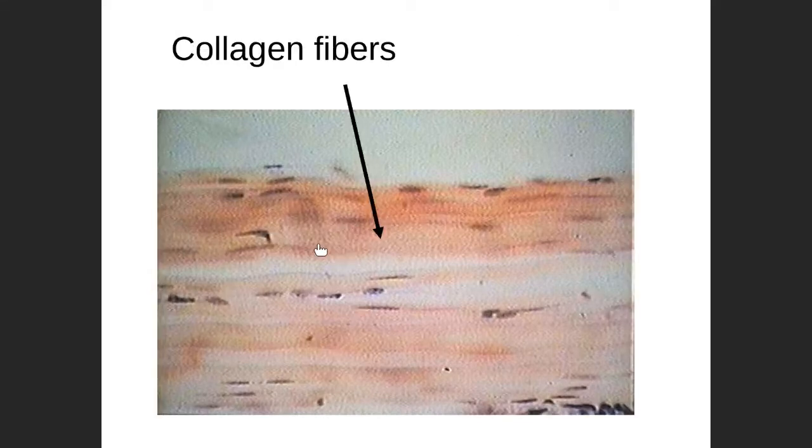Those are collagen fibers, and they're laid down one on top of the next, very similar to lasagna noodles if you bake or cook. They're tightly packed together. There's virtually no ground substance in between, and the majority of the tissue is collagen fibers. And collagen is very strong. It has the tensile strength of steel. So this dense regular connective tissue will be predominantly found in your tendons and your ligaments. Tendons and ligaments.